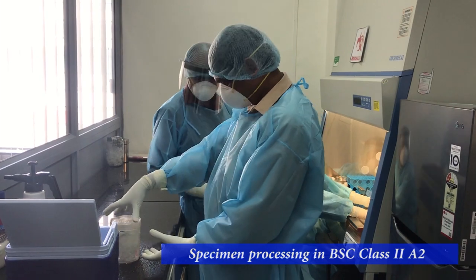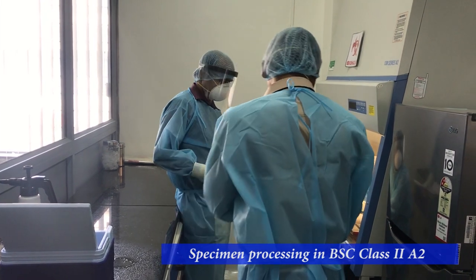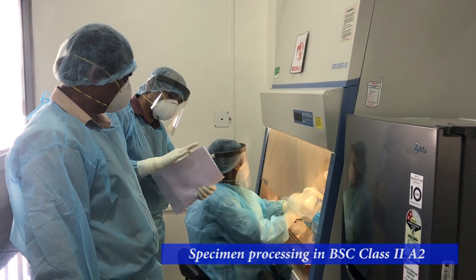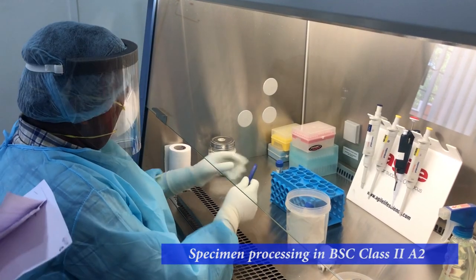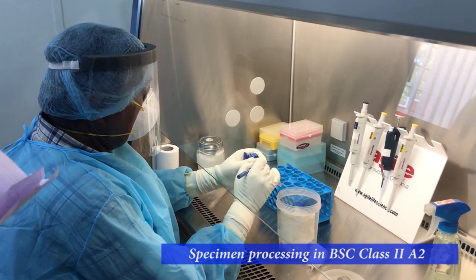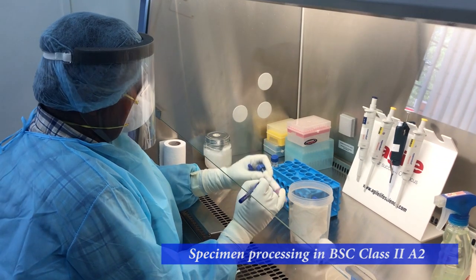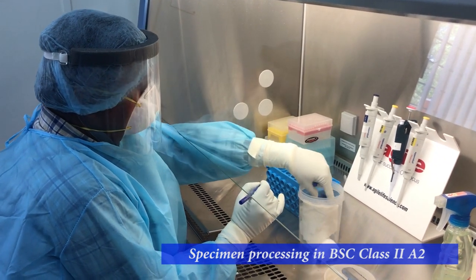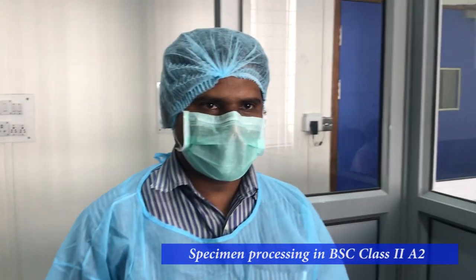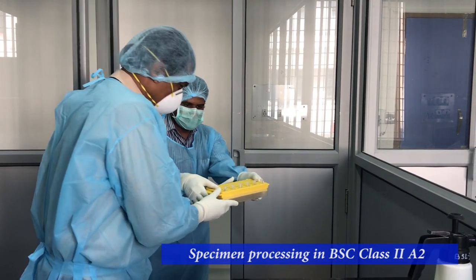The biosafety cabinet will have material only required for the sample separation. Remove the specimen tubes and arrange in the rack. Write the sample ID numbers. Lysis buffer for RNA extraction is aliquoted from the RNA room and given to the sample separating team.